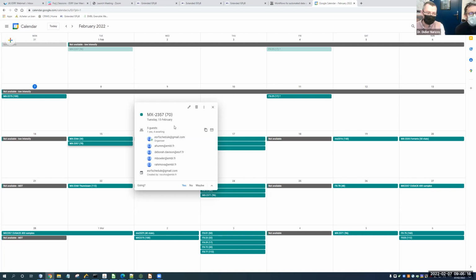Don't try to multiply your samples by a factor of 2 or 3, because that starts to be problematic. But if you say 70 and you've got 80 or 90, then it doesn't matter very much. We currently limit it to 160 in 24 hours, which is roughly what we can do. But again, don't feel that that's a strict limit. If you have 180, just put that in. It's just to try and block off the time so we don't overfill it.